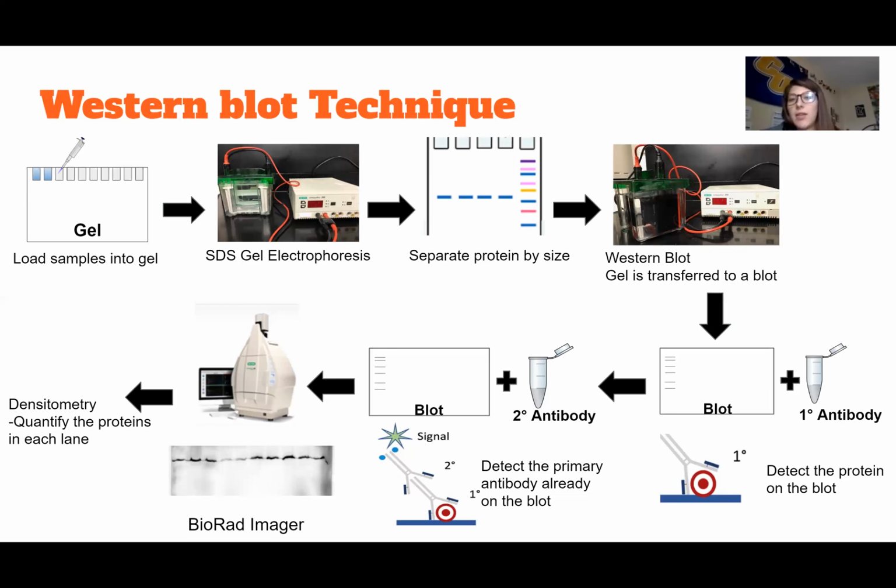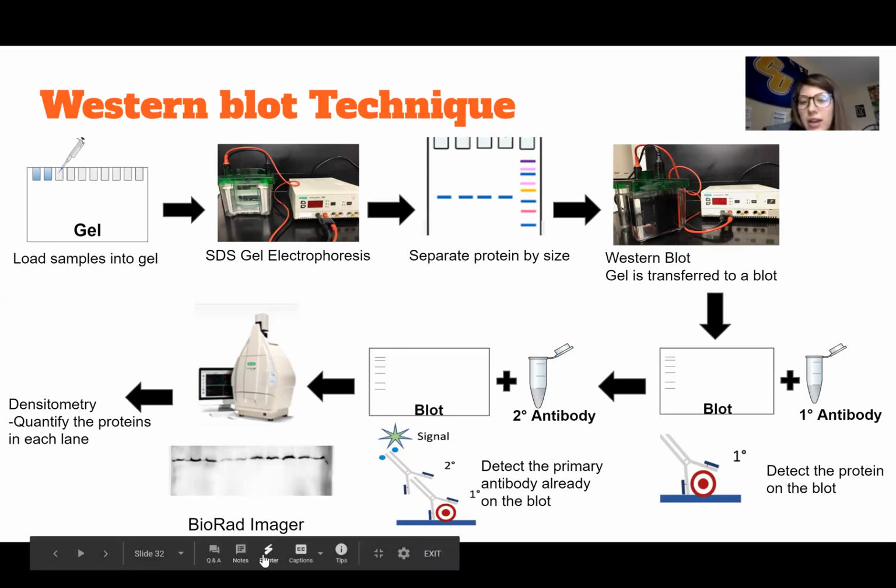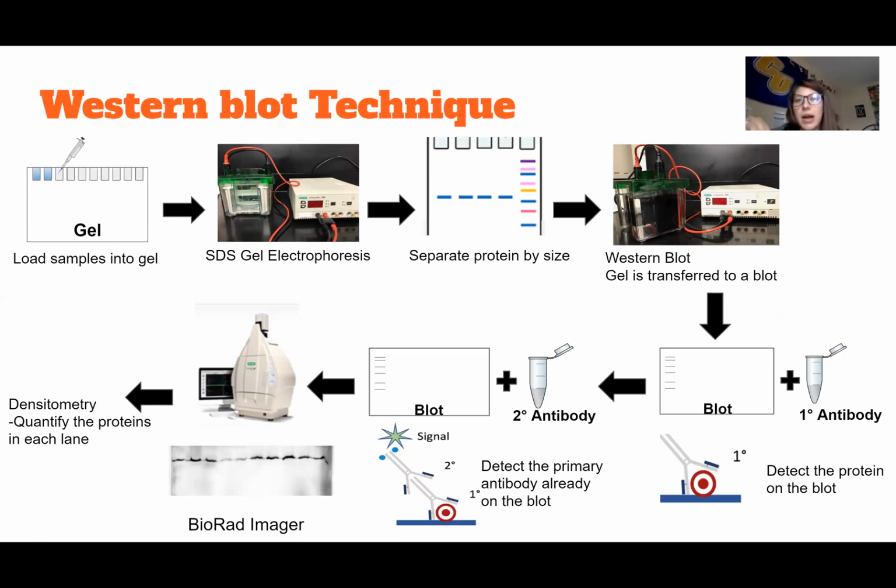And so once we have all that going on, we're a couple days in now. On the bottom right here, we have a primary antibody, and this is where we focus a lot of our attention this semester. Basically, there is an antibody and it's searching. This antibody is saying, okay, where is Cyclin E? It's running around trying to find it, and once it finds it, it binds to a certain part. We'll get into all that fun stuff later.